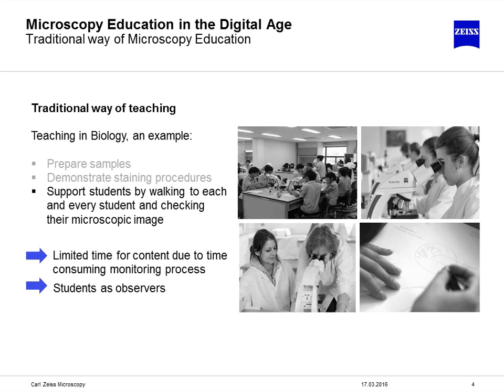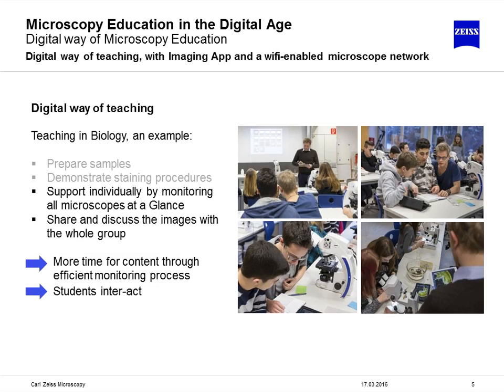Students are observers in these settings. Because of that time-consuming work, you have got only limited time for the content. But that can change in this digital way of education. So in the digital age, a transformation in microscopy education is also going on. But what is the benefit of a digital training course for the students?